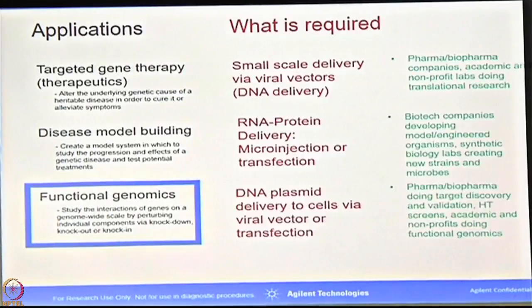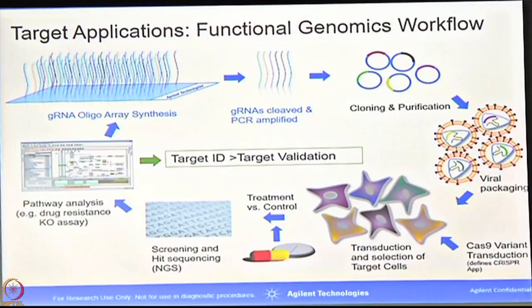But mostly, that's not the case. Multiple genes are involved in any complex genetic disorder, right? Like retinitis pigmentosa, where 77 genes are involved, and more than 1,000 mutations are involved there. So what we do is make guide RNAs for that panel, and this is totally a custom thing. We make some catalog, but we totally depend on the users.